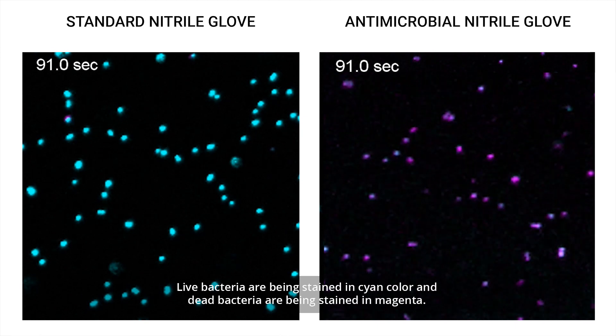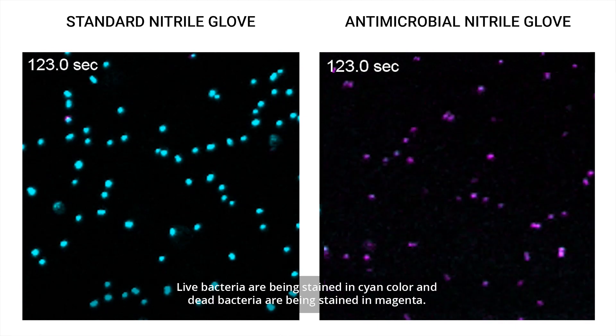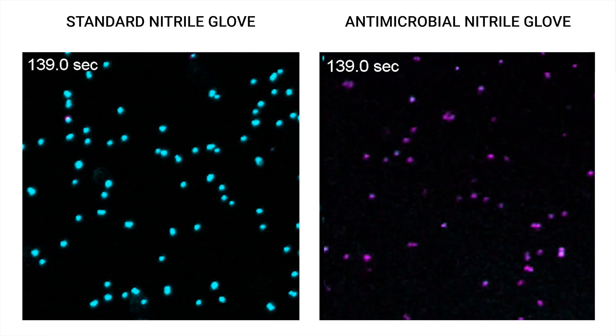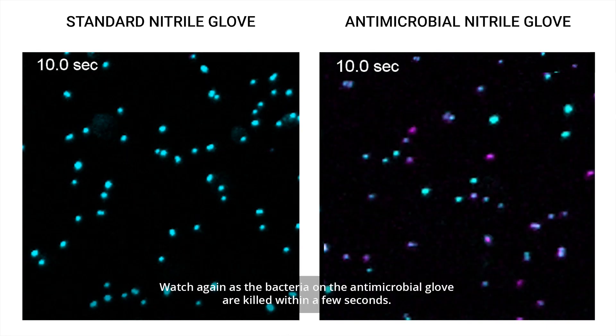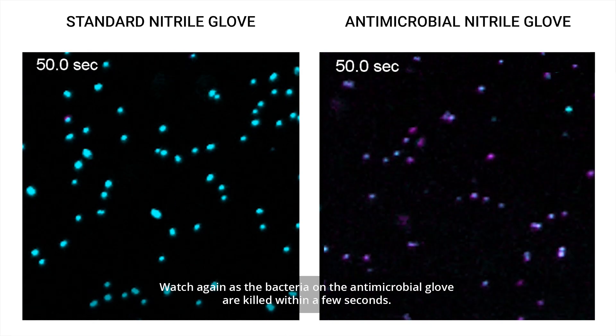Live bacteria are being stained in cyan colour and dead bacteria are being stained in magenta. Watch again as the bacteria on the antimicrobial glove are killed within a few seconds.